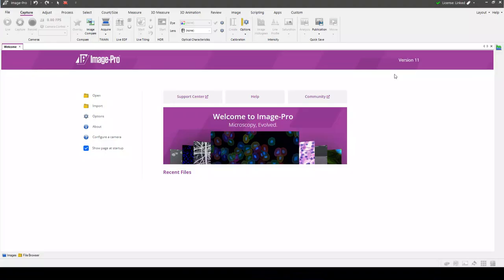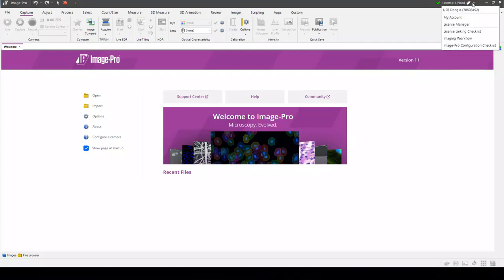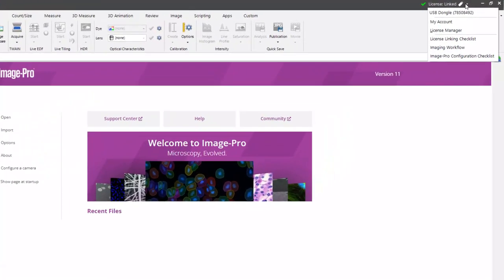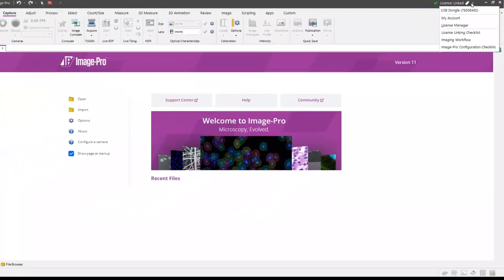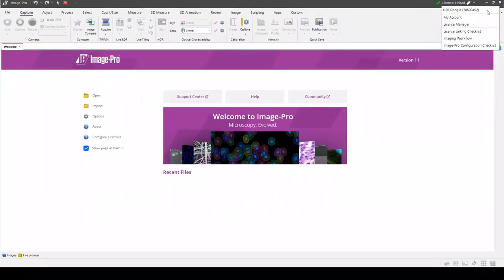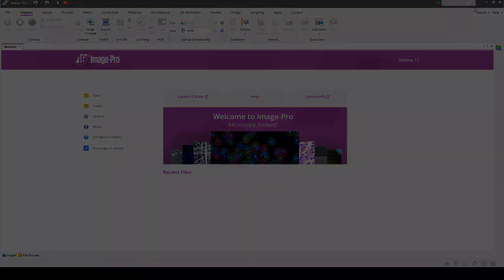ImagePro will now open fully licensed. This time, the License menu on the right shows that our license bundle is linked to a dongle. ImagePro will open fully licensed on any computer to which the dongle is connected.